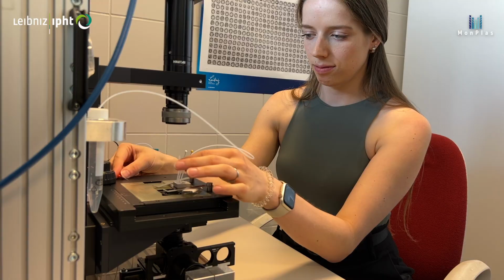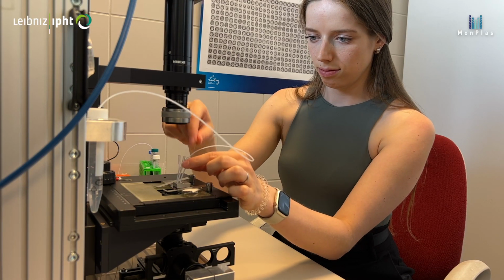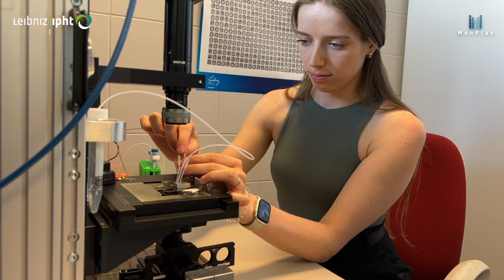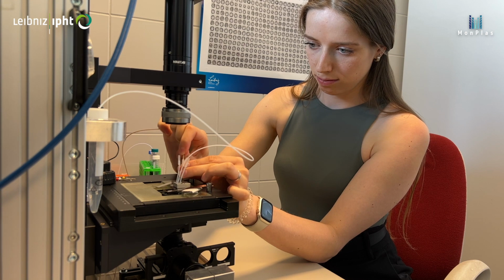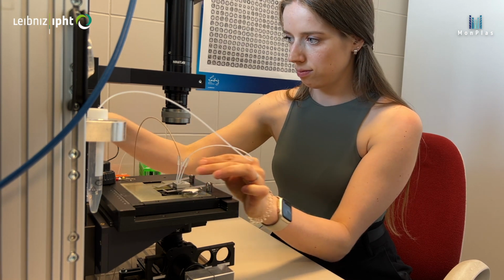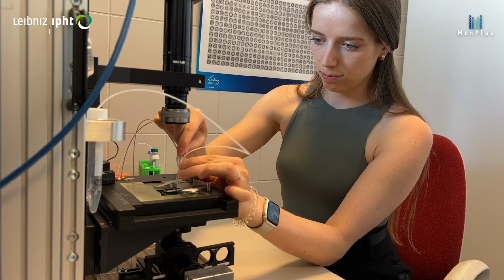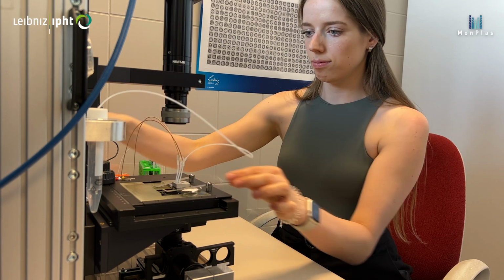No matter if we analyze bioparticles, nanoparticles, or microplastic particles, our image processing methods are very similar. In my most recent project, we analyzed the microalgae Haematococcus pluvialis, and in its original state, it's very small and green, but under stress conditions, it starts to change and becomes bigger and red. So with our microfluidic systems combined with imaging flow cytometry, we were able to track the morphological and spectral changes of the microalgae over the entire process for different stress parameters.